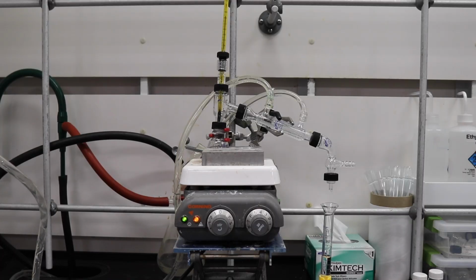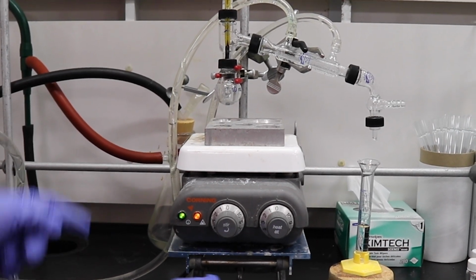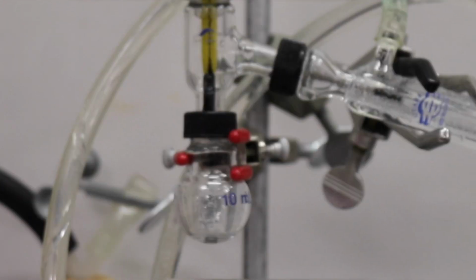Once the system heats up to boiling, we're going to watch and record the temperature at the first drop, and then we are going to keep recording the temperature every half mil, which is about 5 drops. As you can see, we are collecting some of the compounds. Once we have collected about 7.5 mils, we remove the heat from the system. You never want to distill to total dryness because your system could bust.